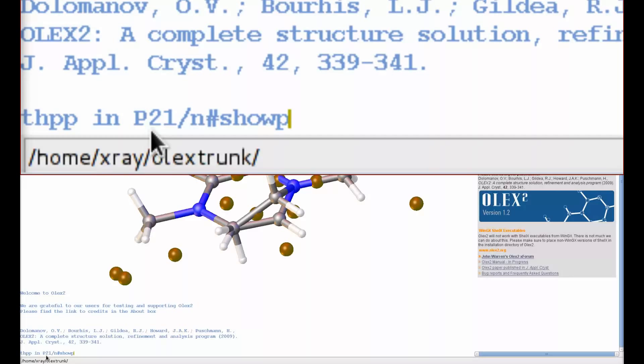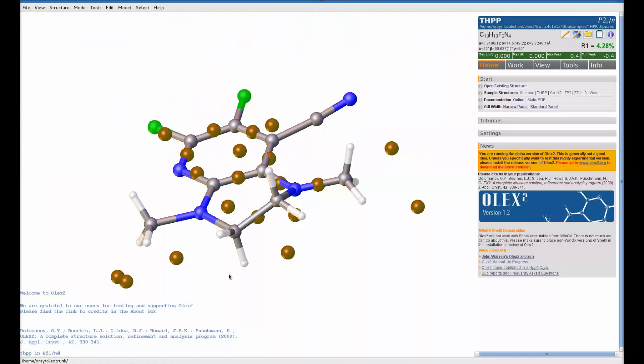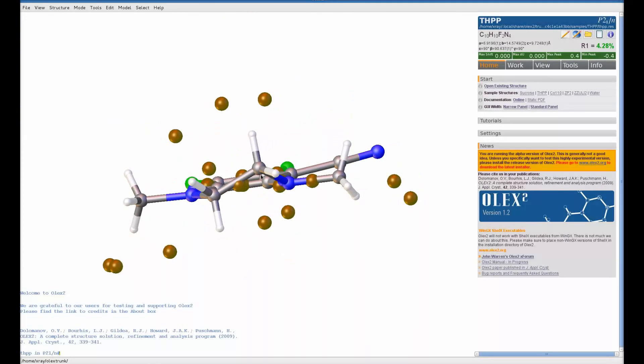SHOWP 0 and 1 will show all of the part that belongs to part 0, which is the default structure, and the disordered components in part 1. As you can see, our model now only has one disordered component.